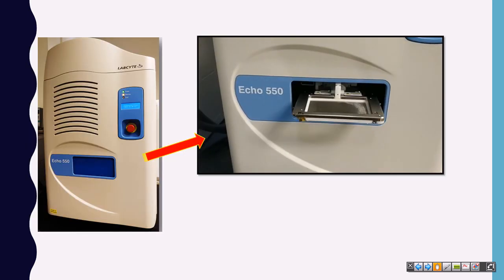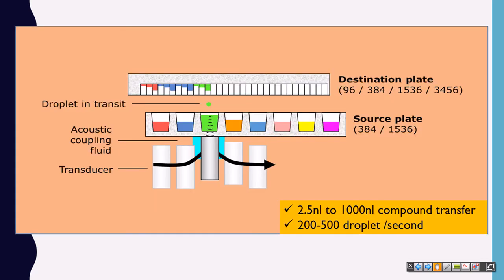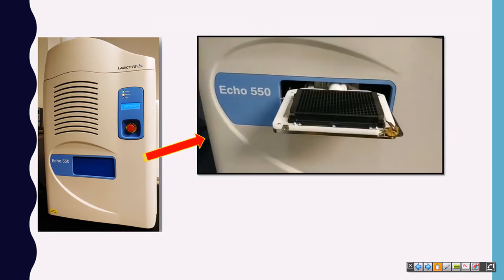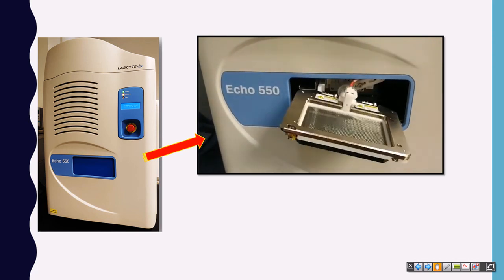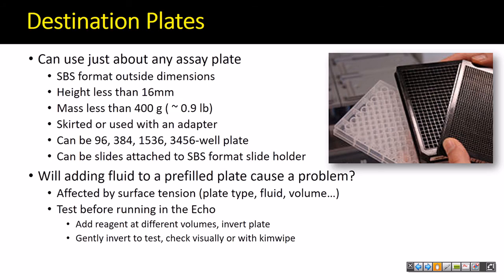So here I put a video picture of how the instrument does the inversion of your plate. Here I'm showing the plate is inverted, so you just put your plate on this handle, and then it will rotate back and take it inside. So it's quite okay. And with this system you can use several other kinds of plates also, like the 96 well plate, 384 well plate, 1536, and I think above that there are 3456 well plates also. In place of the plate, you can use other things like slides and other things which can be attached to that handler system.